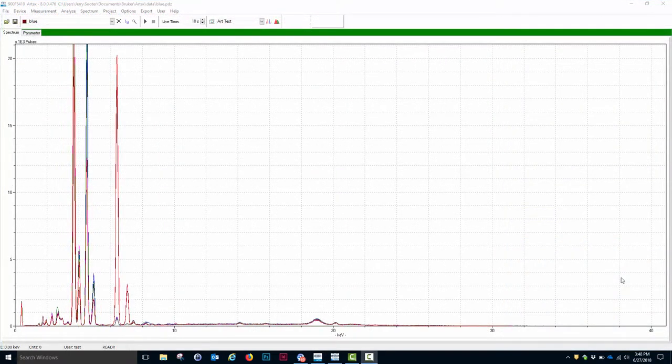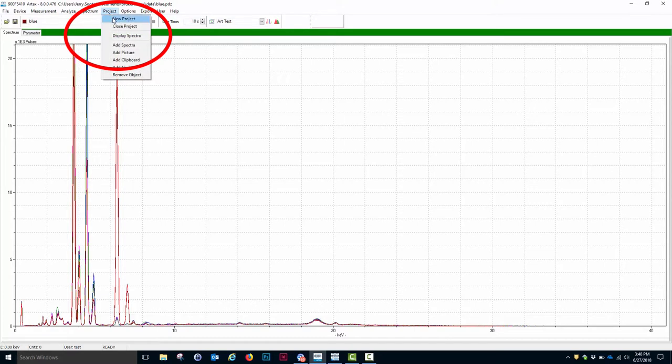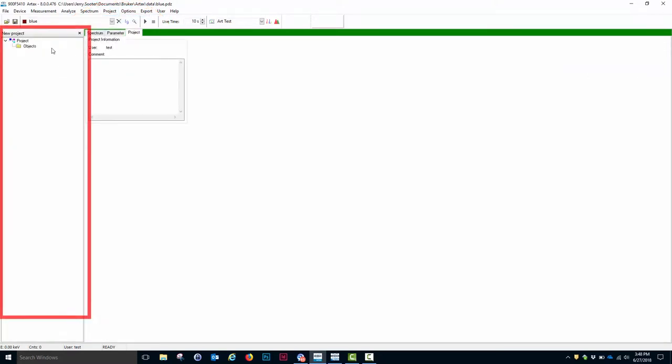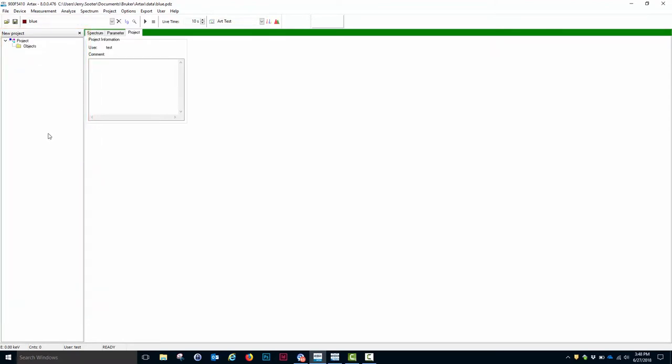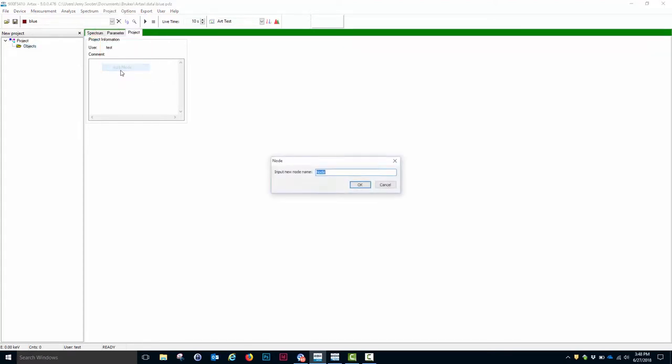I have now acquired six different spectra that we'll need to process. The first thing I want to do here is create a project to contain these spectra. I do that by going to the Project tab, click Project, and click New Project. This creates a project column on the left side of the screen. The next thing I have to do is I have to add a node to this project. So I select Objects, go back to the Project icon, and click Add Node. In this case, I want to call the node Points, and I click OK.